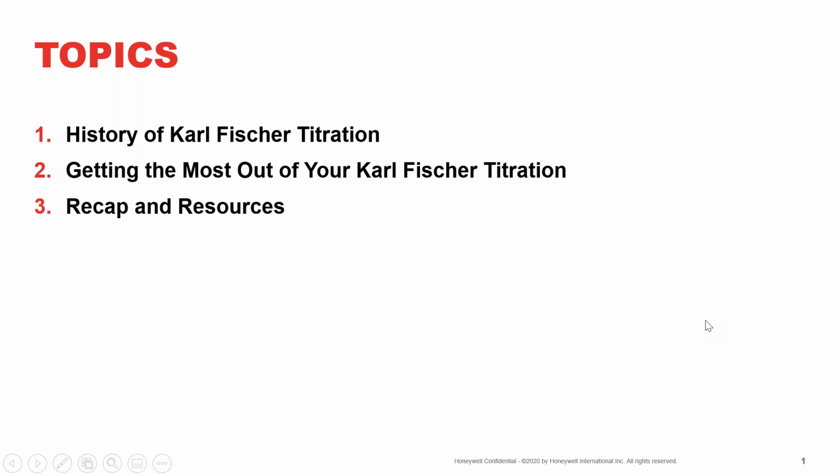Okay, as a very high-level summary, today we're going to start by reviewing just some brief history about Karl Fischer titration, and then we're going to dive straight into what we're all here for. So some tips, tricks, as well as some advice to help us get the most out of our Karl Fischer titration. This is a very broad category. There's plenty of things we could dive into. So today we're really going to focus on the reagent system and how you can work with your reagent system to improve your Karl Fischer titrations. Of course, there's topics with instrumentation as well as some other auxiliaries that we'll mention, but like I said, we're going to stay focused on the reagents here today. Then we'll wrap up with a little bit of a recap about what we learned, and I'll leave you with some resources that you can use after this webinar.